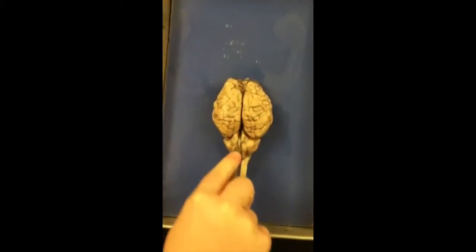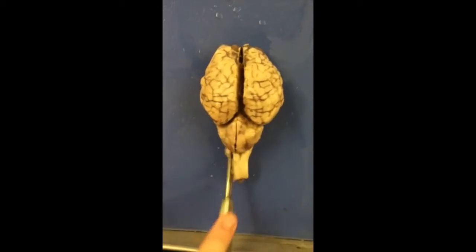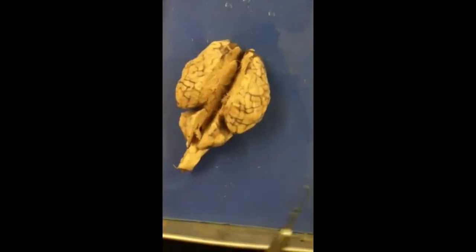And I'm Amber. Today we will discuss the different parts of the brain and their functions. We will be showing where the different parts are located by pointing them out on the sheep brain. Let's get started.